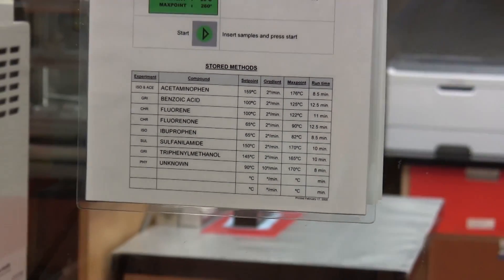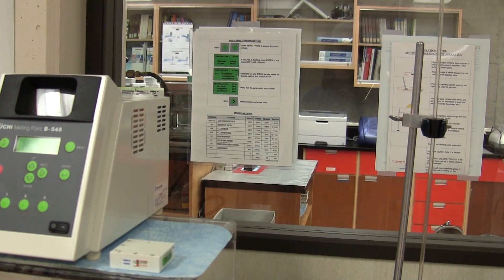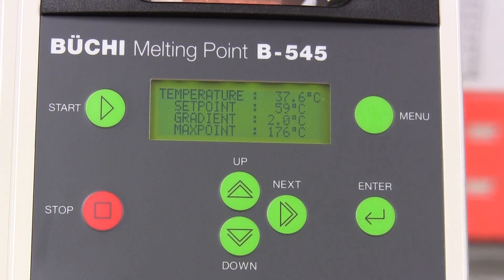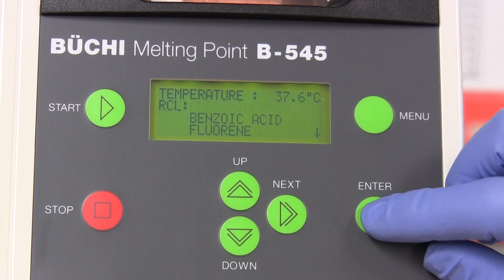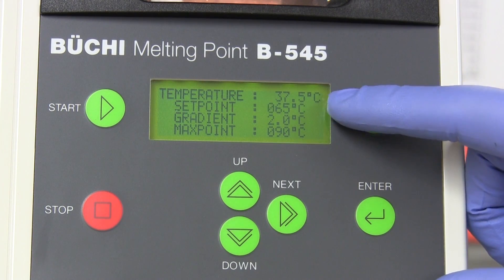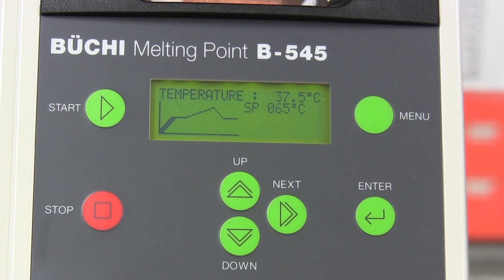The runtime will be 12 and a half minutes once the start button is pressed. But first, the method for fluorenone needs to be recalled. Fluorenone is selected and a check is made to ensure that the heating parameters are correct. The start button is pressed, and the machine will then automatically run through the heating profile of the sample.